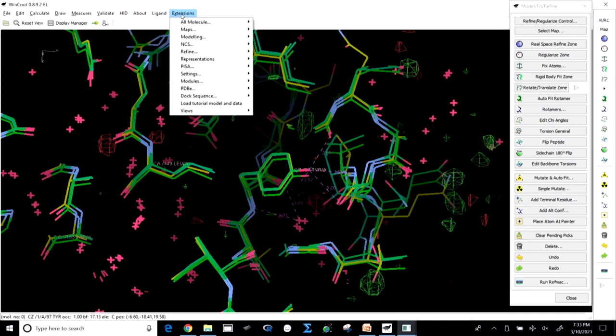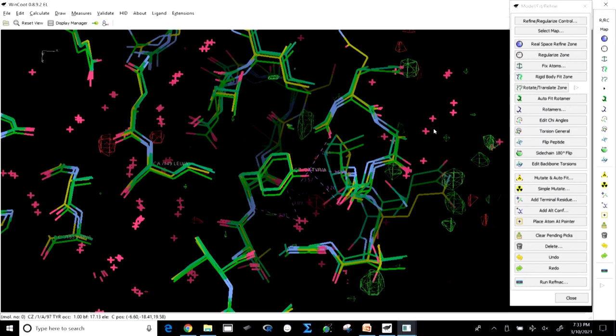Also, you could get a lot of extensions which are helping you to get more options. So, that is in one word the preliminary use of Coot. As I told, this is definitely not enough, but this shows you the power.